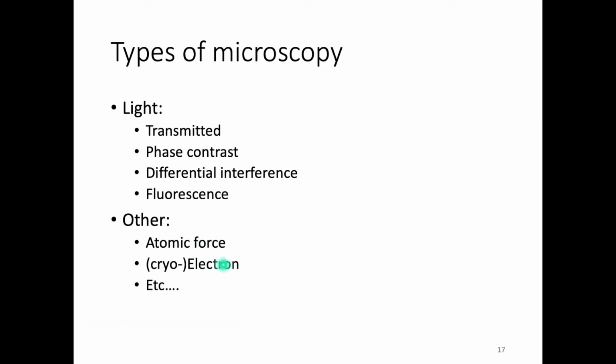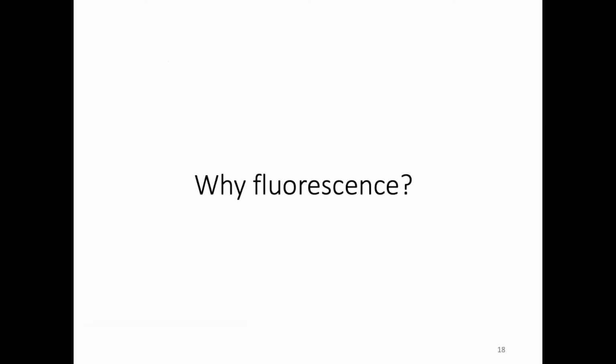Also, you will get this in other courses, atomic force microscopy. It's a little needle that taps on your surface. You can also get very high resolution, and there are other techniques that we're not going to talk about.